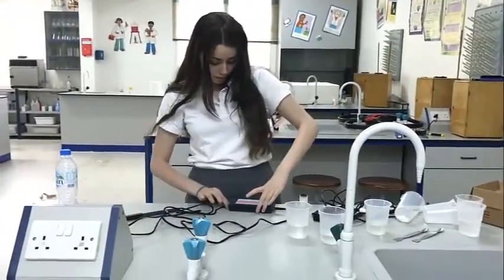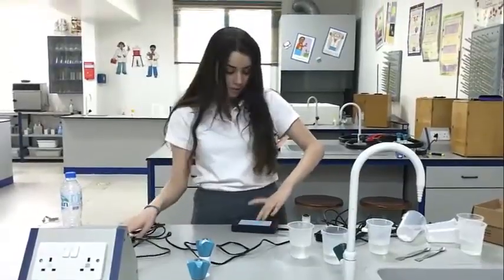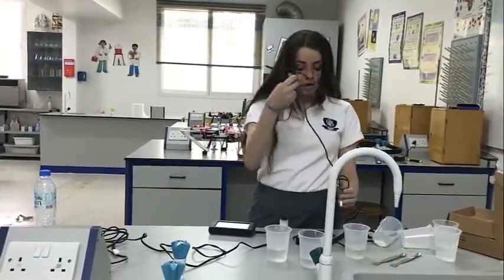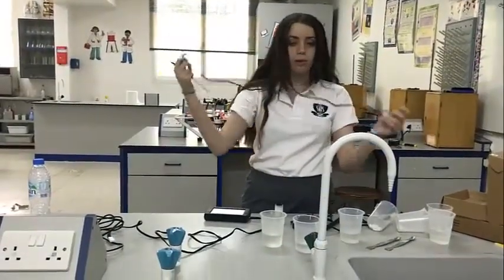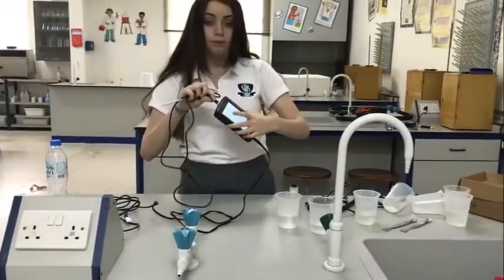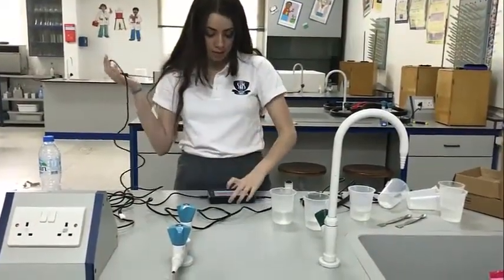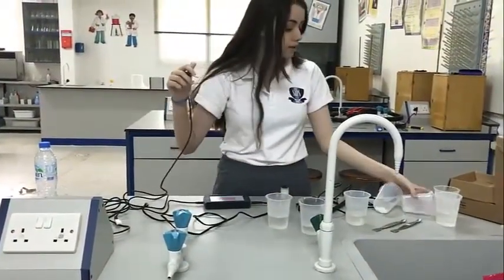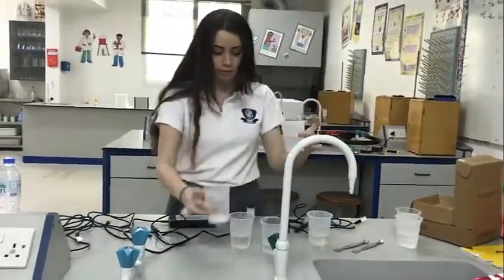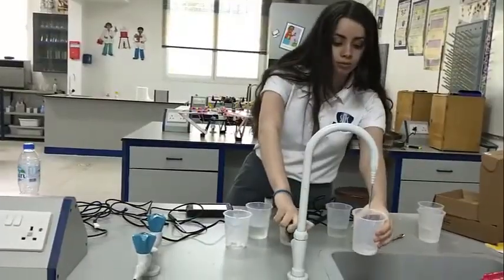Now we're going to move on to the next sensor, which is the temperature sensor. Now we're going to measure the temperature in an endothermic reaction and an exothermic reaction. As we know, an endothermic reaction will absorb heat. Exothermic reaction will release heat. So here I will have to add water.